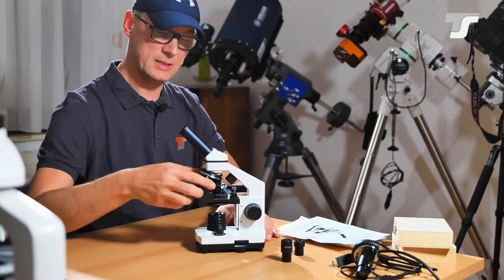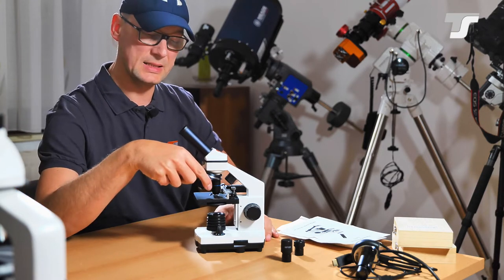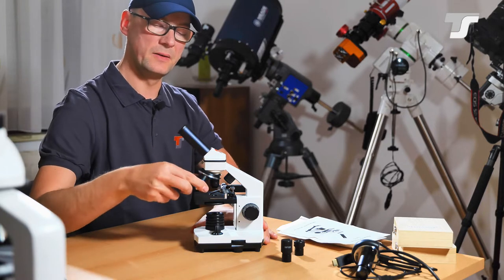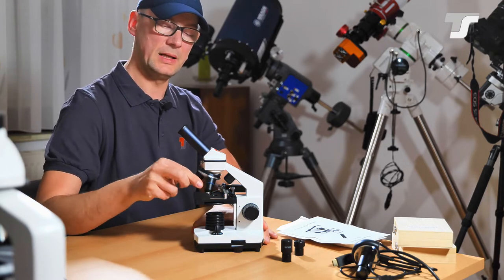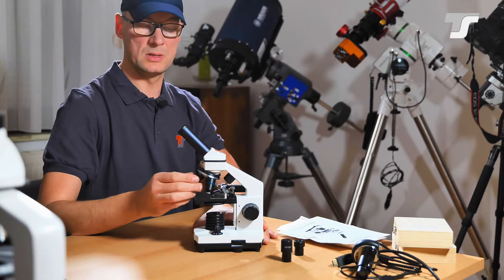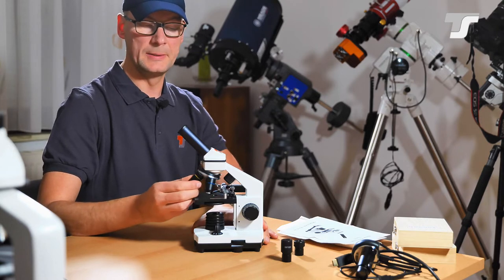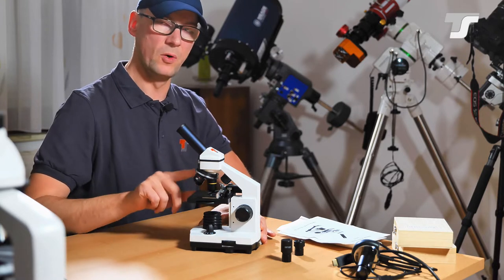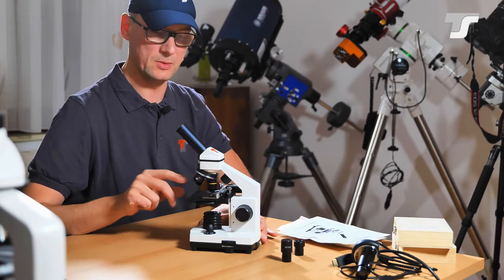The next thing, already mentioned, is also one of the most important things: the objective lens revolver. There are three objectives connected. They are screwed onto the revolver. There is a 4x magnification, a 10x and a 40x objective lens mounted.